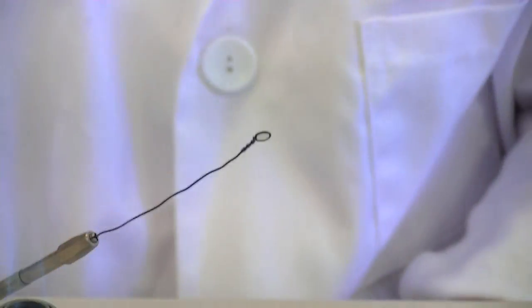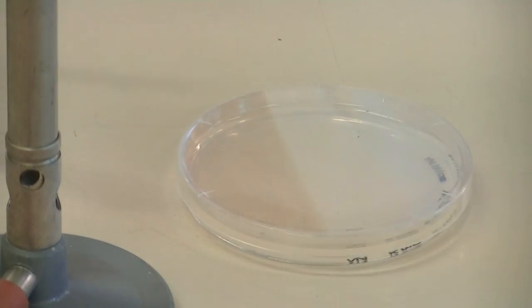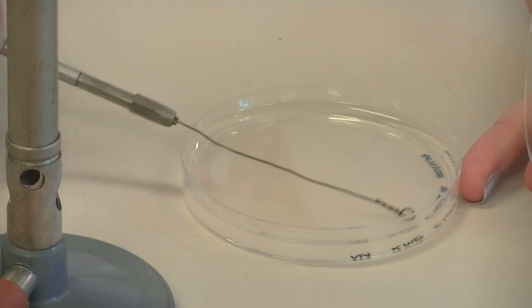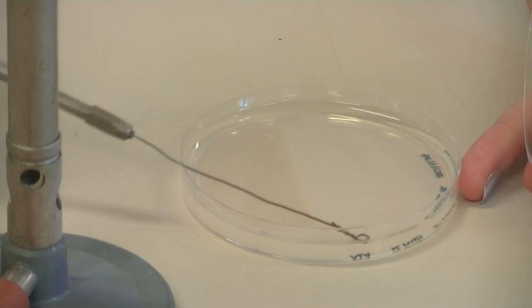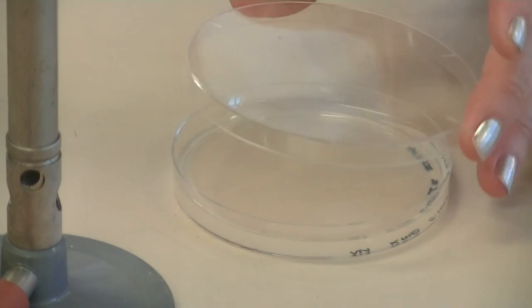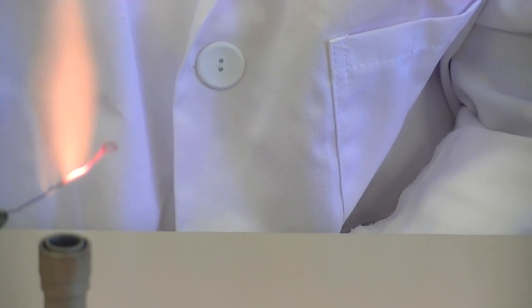Streak this onto the plate — the starting point is where you've labelled the plate. Perform the primary streak lines by dragging the loop back and forth on the surface of the plate. Replace the lid and then sterilise your loop.